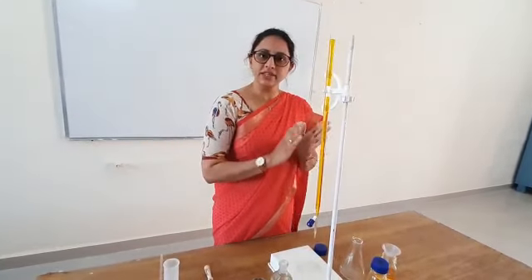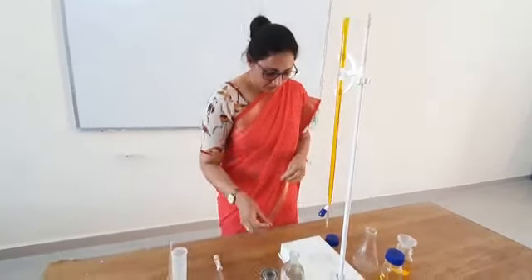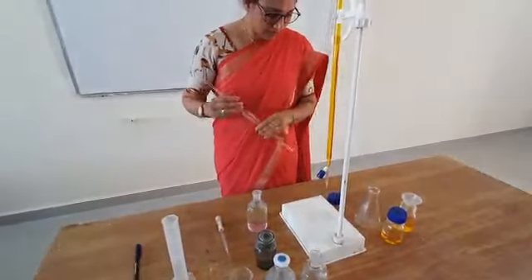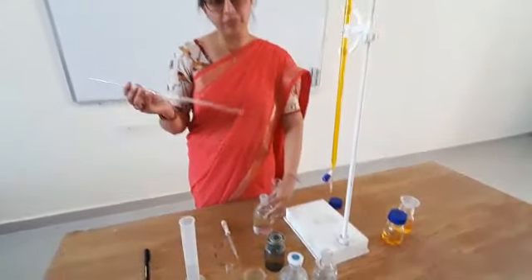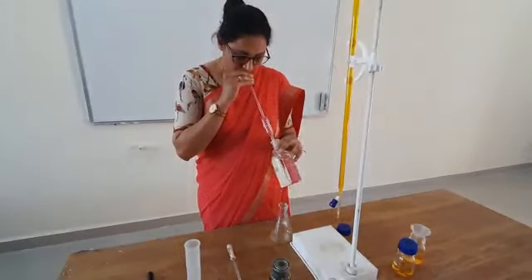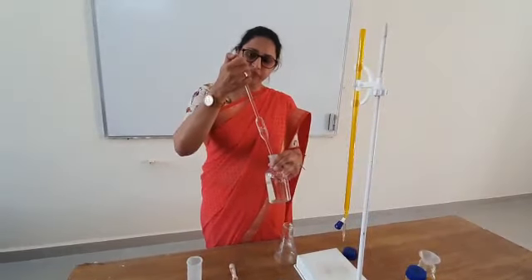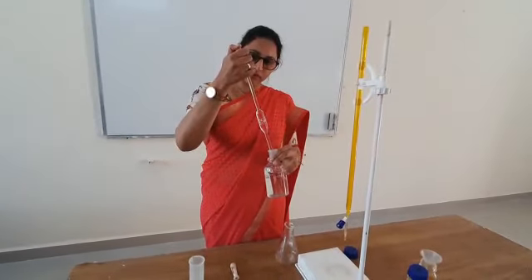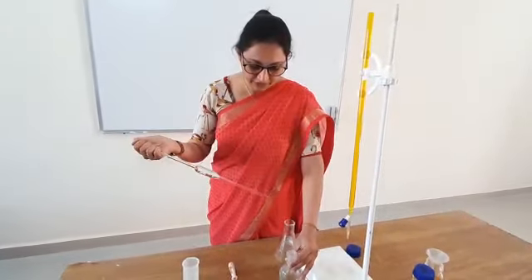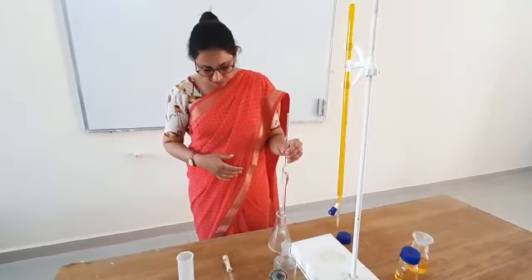First, we are going to standardize this potassium dichromate with the help of known ferrous ammonium sulfate. We will pipette out 25 ml of ferrous ammonium sulfate solution using a pipette, sucking it up to the mark.